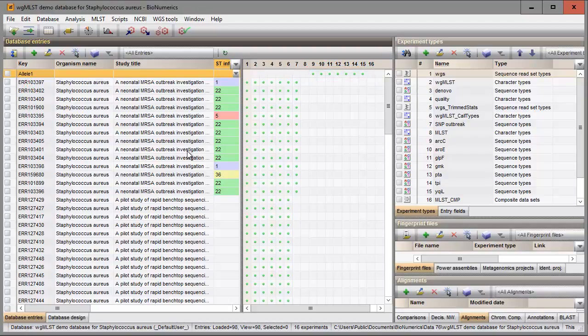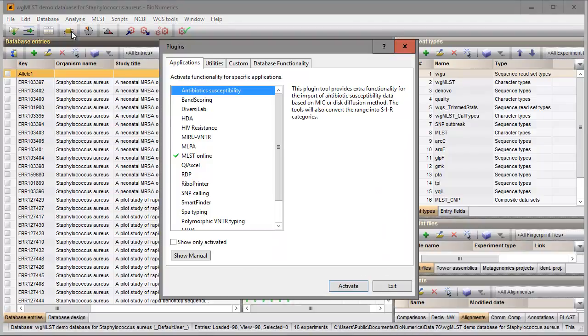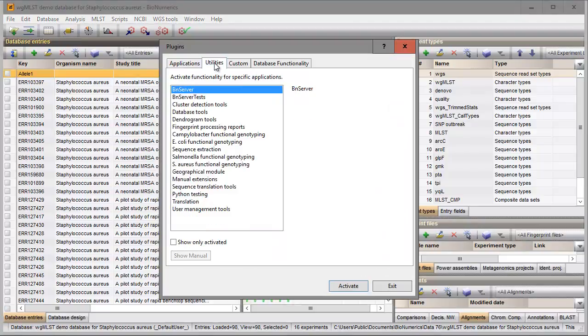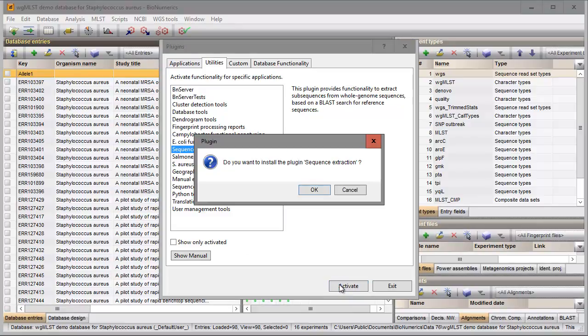First, I will install the sequence extraction plugin in this database. I call the plugin dialog and select the sequence extraction plugin from the list in the utilities tab. I press the activate button and confirm the installation of the plugin.